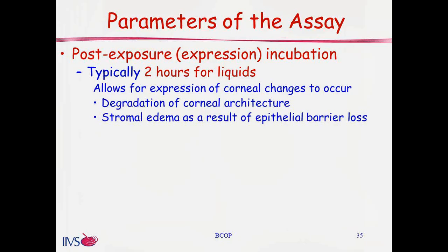Now, the second component of the assay is this post-exposure or expression incubation time frame. For the liquid protocol, we typically have a 2-hour post-treatment incubation time, and this allows for expression of corneal changes to occur. For example, degradation of corneal architecture, loss of barrier function, epithelial damage, perhaps activation of proteases which allow for the cornea to become further degraded.